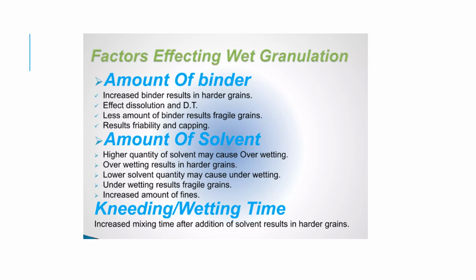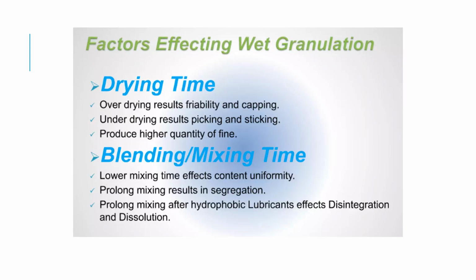Then next is mixing time. Increased mixing time after the addition of solvents again results in harder granules. So after adding the binding agent, if the time of mixing is also increased, it may lead to harder granules. Next is drying time. Over drying will result in capping.